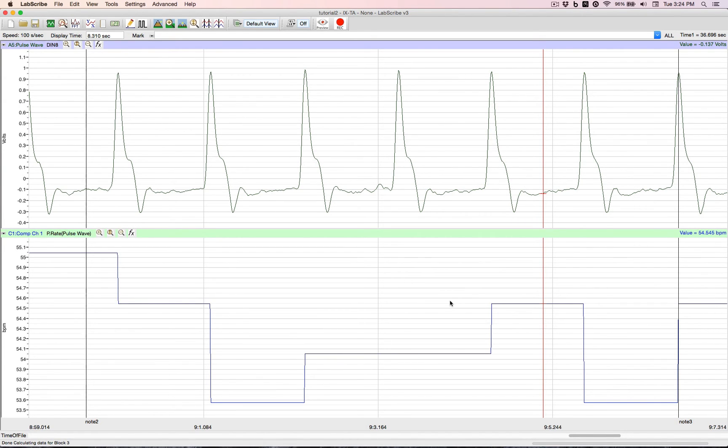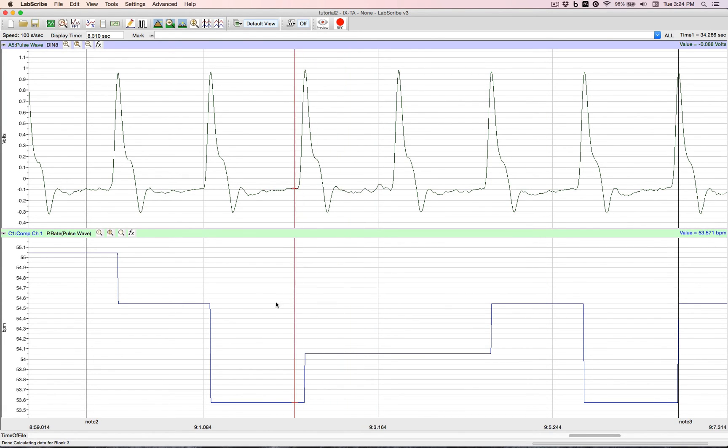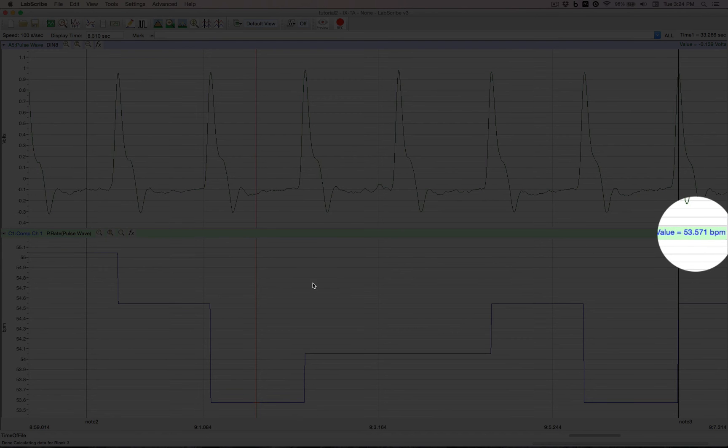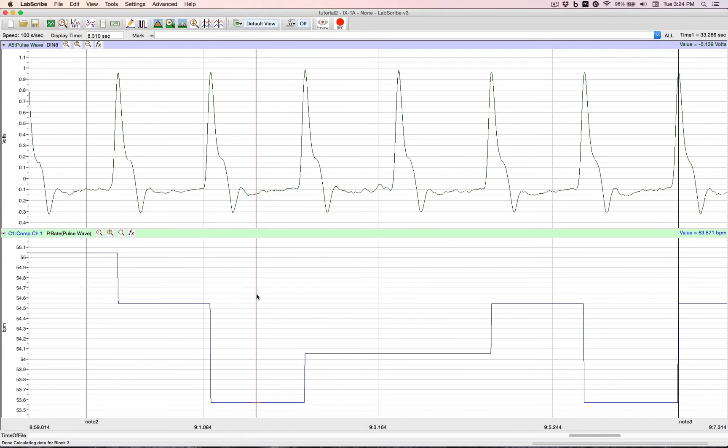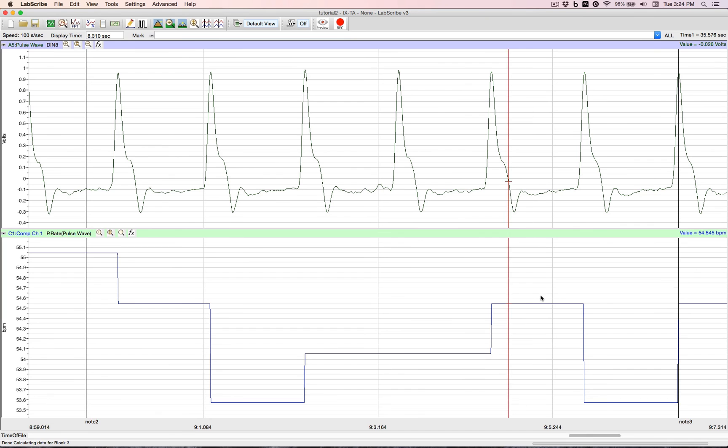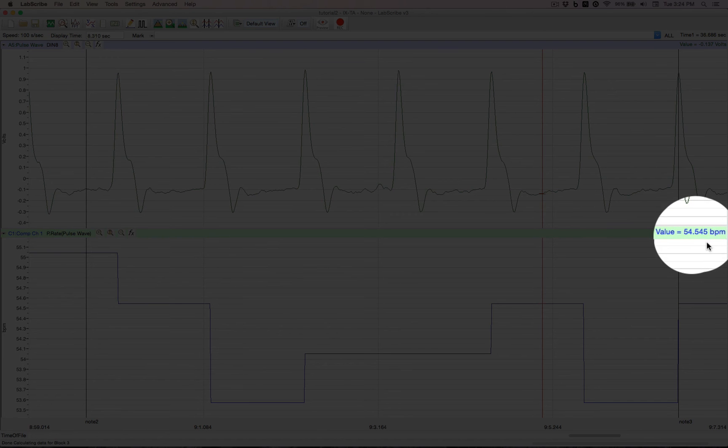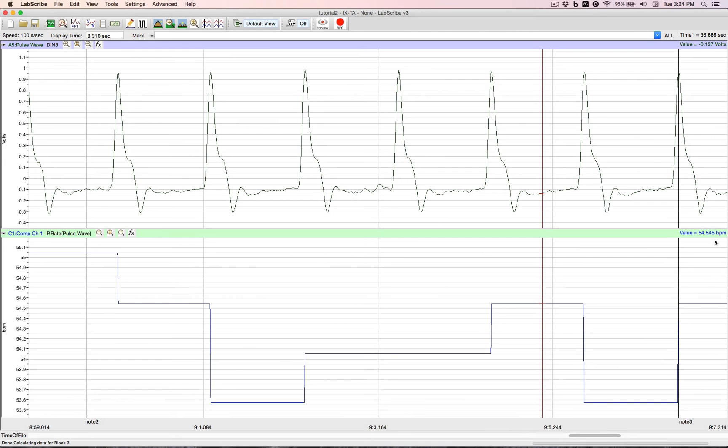Bring over a single cursor so we can do some measurements. And that's all there is to doing computed functions in LabScribe.